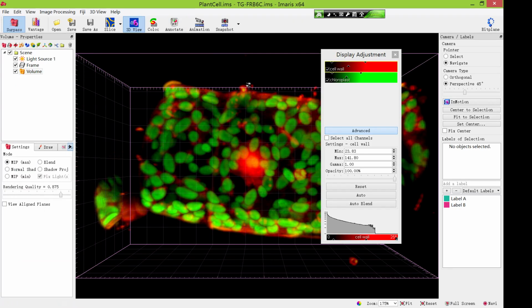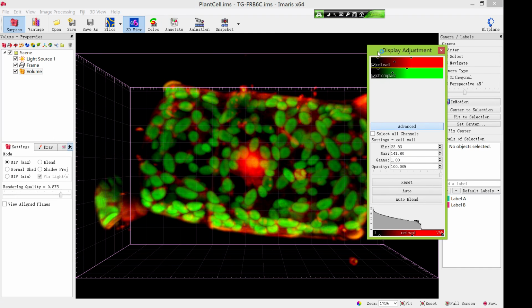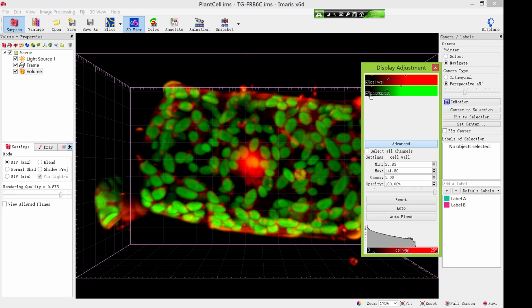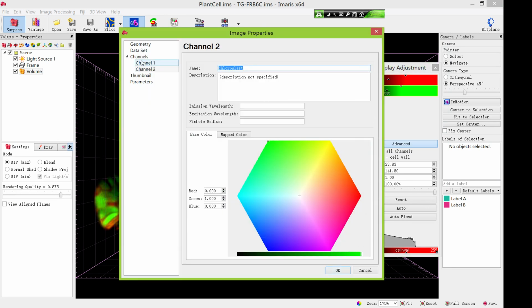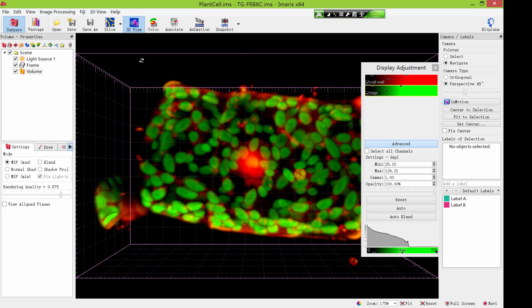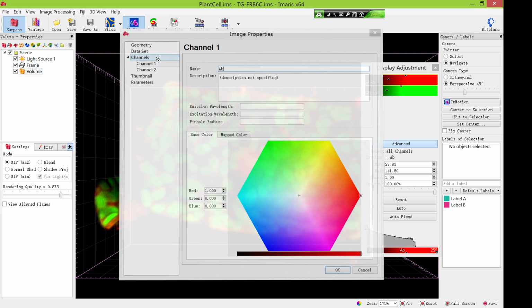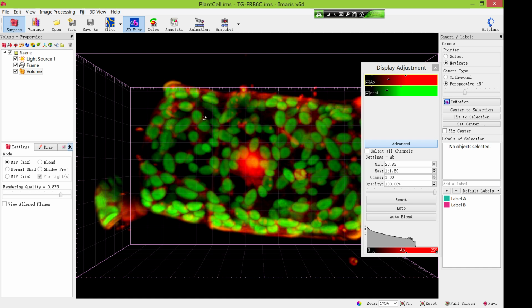In this video, I will show you how to create the surface and the spots in Imaris. Let's suppose there are two channels here. Let's suppose this is a DAPI channel, or something like a cell nucleus stain channel. This is the antibody you are interested in, the staining antibody. So the aim is to create a surface object for the antibody and a DAPI object for this DAPI channel. So click the surface, it will show Surfaces 1.